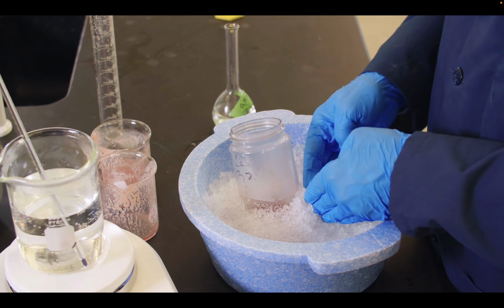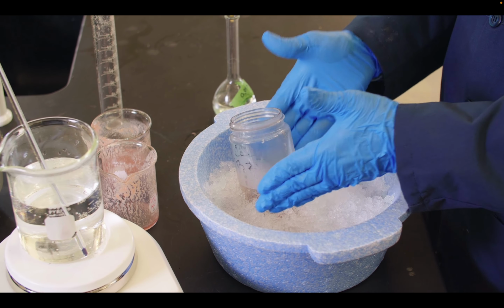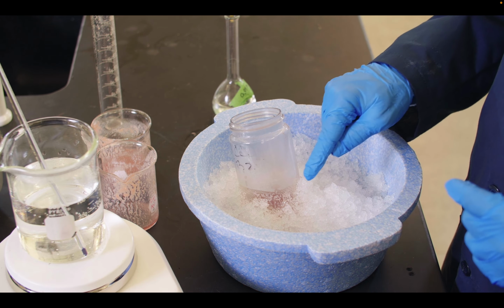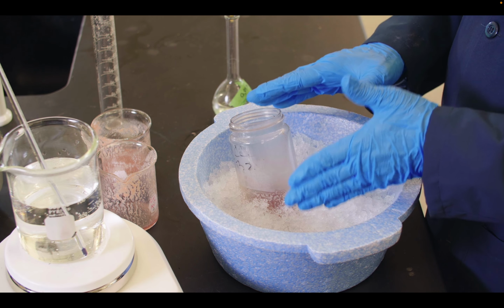And now, since we've heat stabilized the GOT, and we've heated it, we should not denature much of the GOT, but hopefully we denature some of the other ones. However, we want to make sure that we cool the whole thing down so that, one, we can bring the temperature down for GOT to help maintain it, but also we want to make sure that any proteins that are denatured or maybe slightly denatured, we cool those down and those can precipitate out. So we're going to, again, ice this down for another 20 minutes.